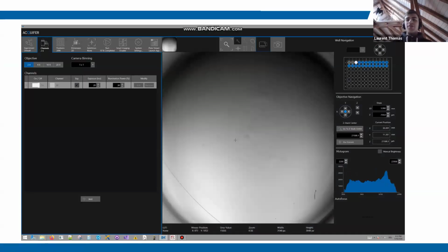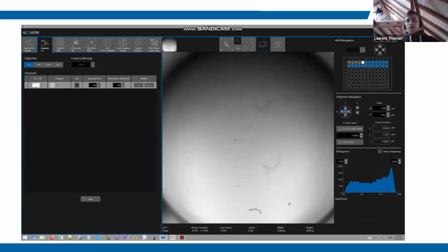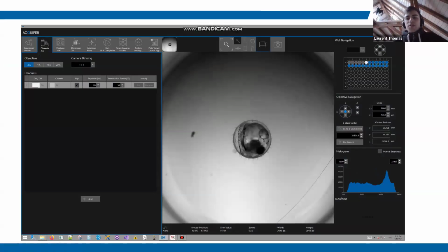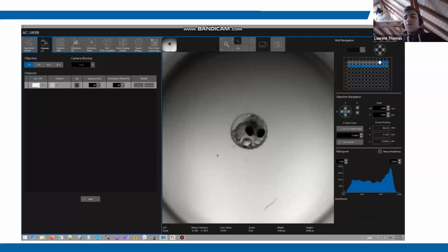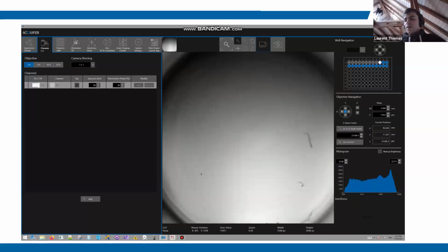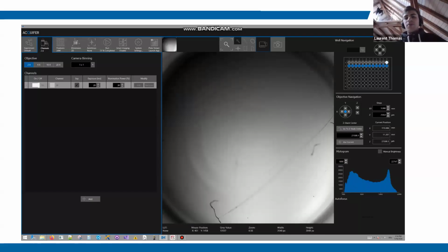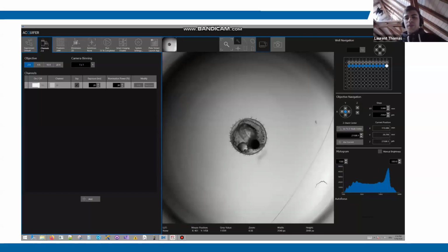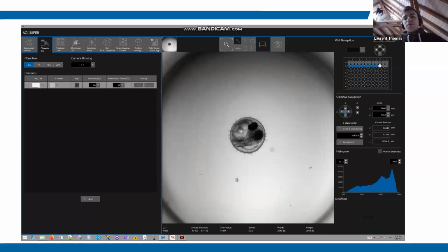So that started now. So some wells are actually empty in this plate. It's not typically the case, but that's kind of a use case. Because then with the template matching, I can automatically filter those wells based on the score of the detection. So the empty wells typically had a lower score. Also, maybe one word actually about the sample here.